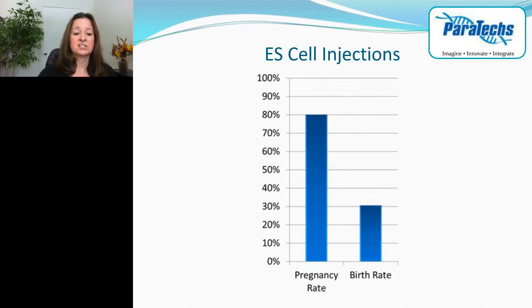Non-surgical embryo transfer can also be used to transfer embryos after ES cell injections. This data is courtesy of the microinjection service at the Jackson Laboratories. Here, C57 Black 6 blastocysts were injected with JM8A3N1 ES cells, and then they were transferred into the 2.5-day pseudopregnant CBY-B6F1J recipients.